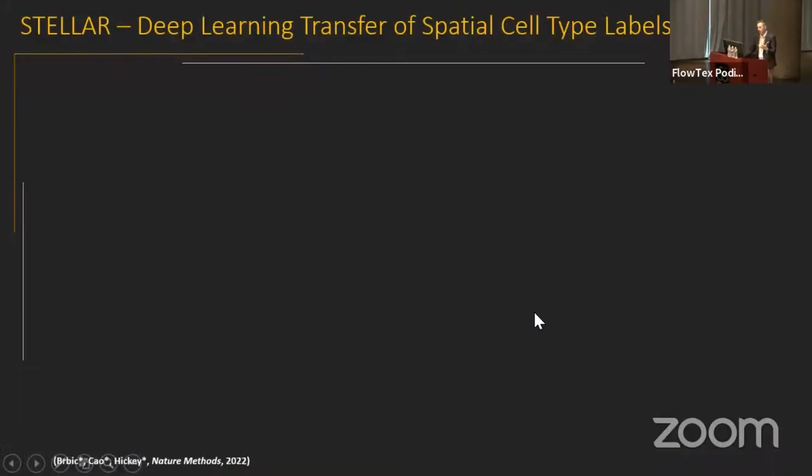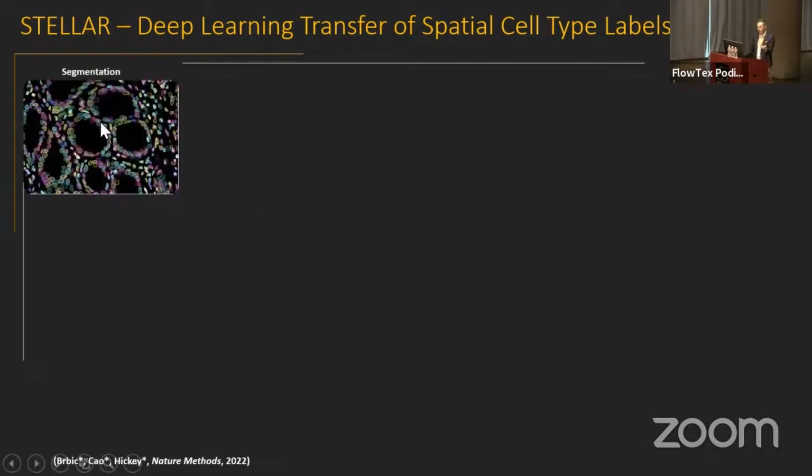And we can use many different markers and be able to identify many individual cell types. So how do we start to think about this beyond just pretty pictures? How do we get quantitative measurements? This is how it comes to be like imaging cytometry, right? What we do is we apply a deep learning algorithm that draws a little segmenting border around each individual cell.